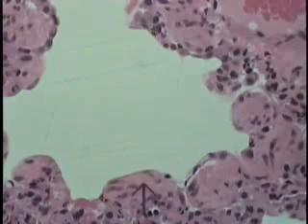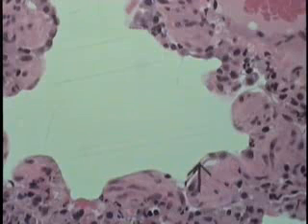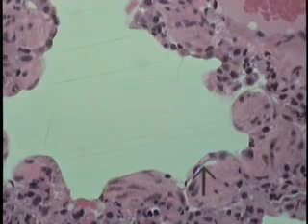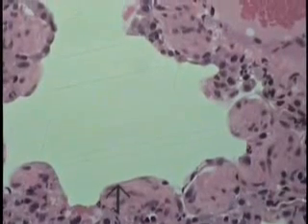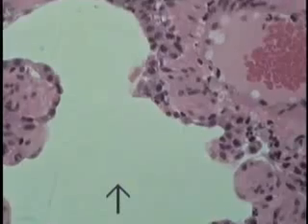Then the bronchial muscle appears again here, it jumps here, it jumps over here, and usually, but not always, these smooth muscle bands as they project into the lumen of these respiratory bronchioles are going to be covered usually by a cuboidal type of epithelium. In this particular case, this does not appear to be the case. It looks like an alveolar type 1 cell that's stretched out and entering the lumen.